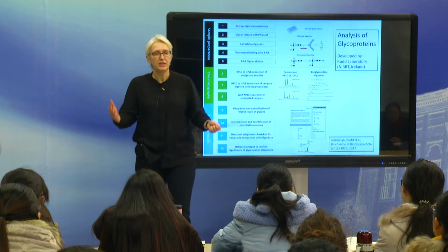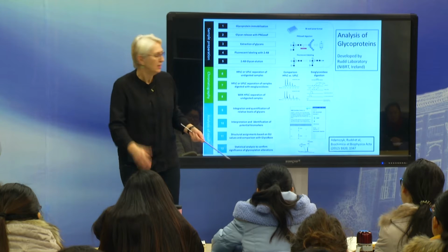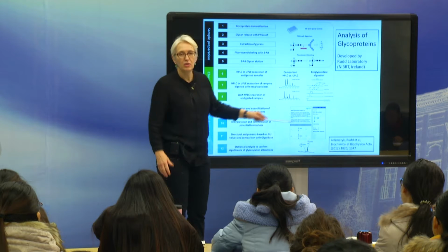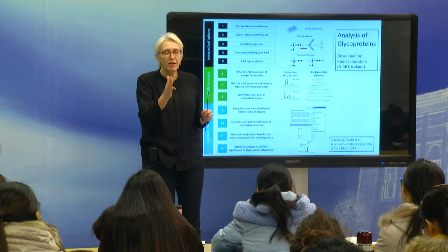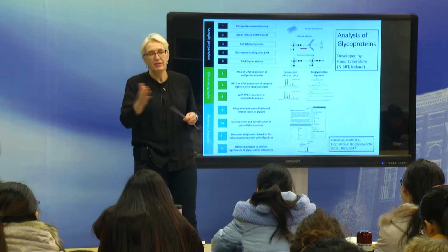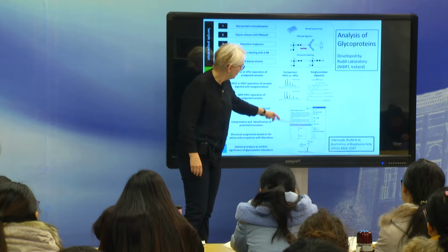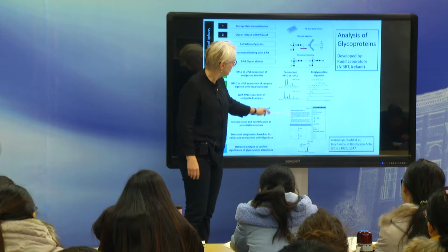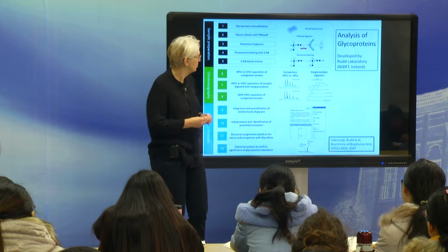And then obviously once you've done this for one protein, if you go for another protein in the same organism, you start developing an understanding of where these peaks run. If you run your UPLC very carefully, the same glycan will appear at the same retention time. You can compare it with standards, and there's now a massive amount of knowledge. There are databases which can allow you to predict retention times or give you retention times for these structures.